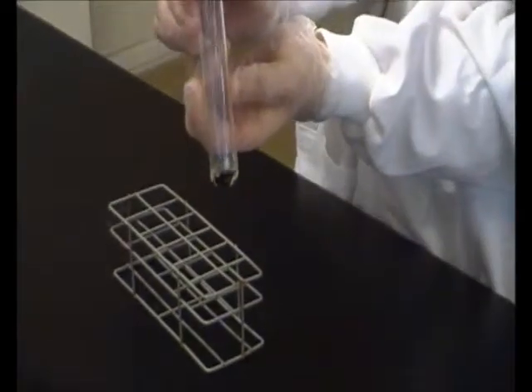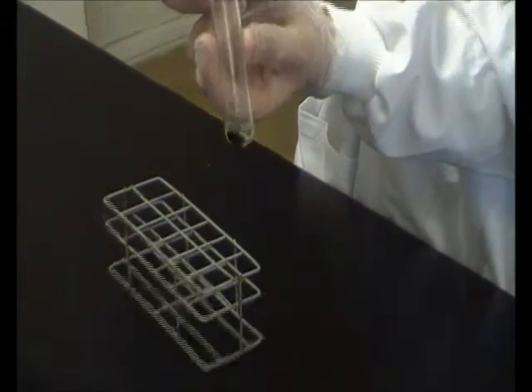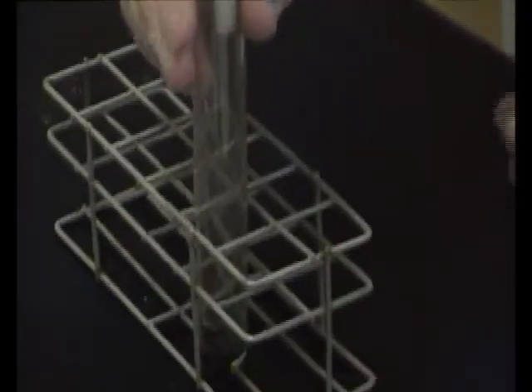As you can see, the solution has already changed colour, so we already have a reaction occurring. It's starting to look like the dye that we want. Put it back for a second to let it finish the reaction.